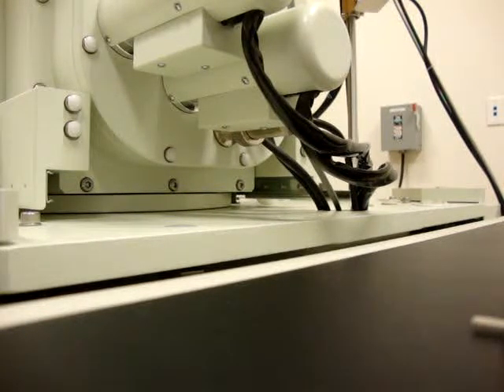What is dynamic focus? I still don't understand dynamic focus. Okay, dynamic focus. Let's say we're looking at a wafer, something that's really big. You have an upper and a lower range of focus with the beam.